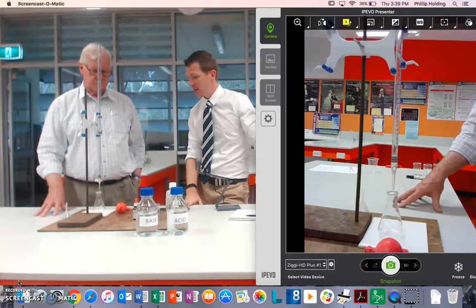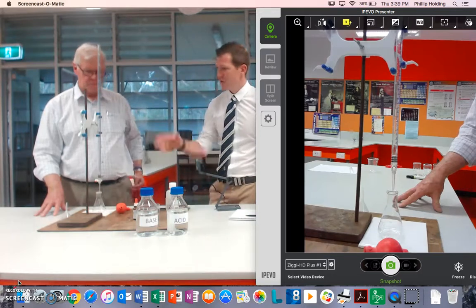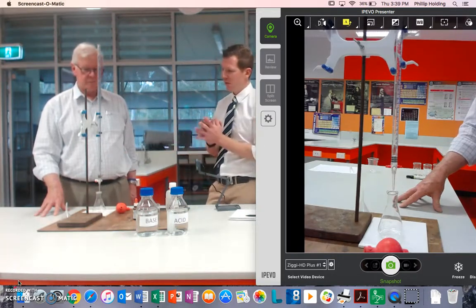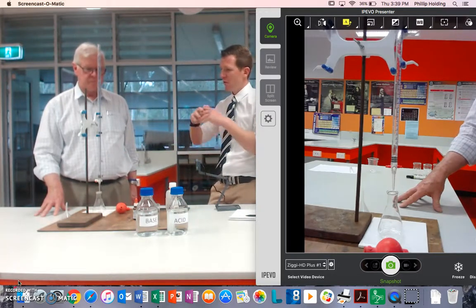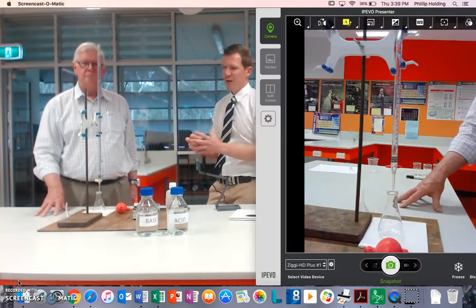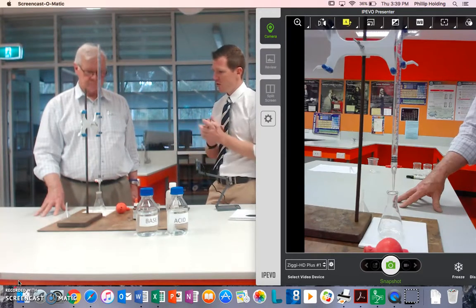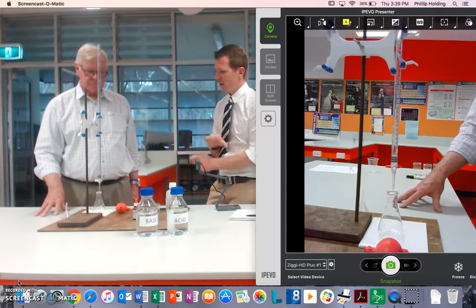So, Mr. Jarrett, this is obviously our burette. We've cleaned it. We've done everything. Now we want to fill it ready to actually do our titration. So what do we need to do to be able to do that?